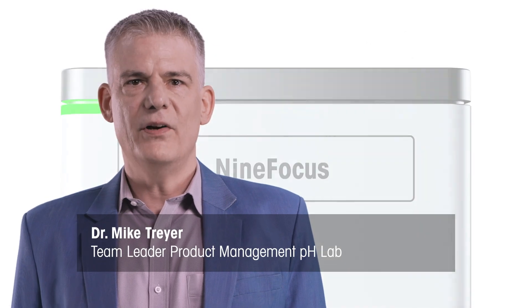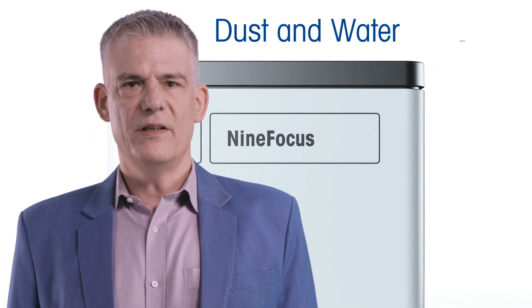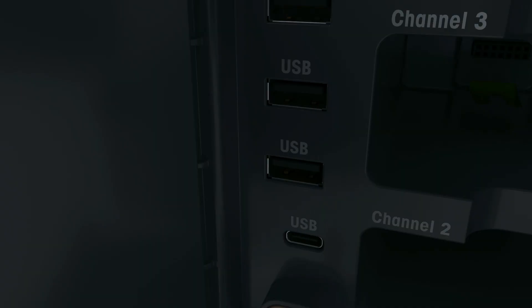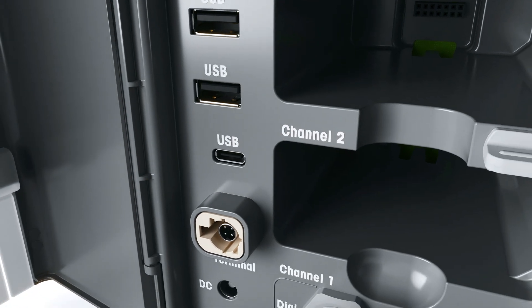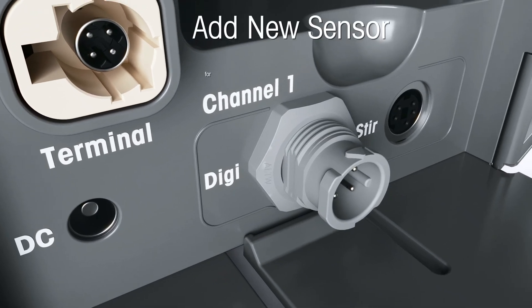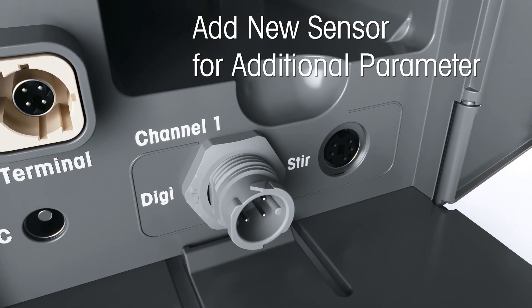Durability and adaptability were at the heart of our design process. The 9Focus meter comes in a dust and water resistant case, perfect for the hustle and bustle of a busy lab. But protection alone wasn't enough. We wanted a system that can evolve with your needs. That's why we made it modular. You can easily swap in parameters and expand its capabilities. With a built-in digital measurement module, you don't need multiple meters for different applications — just add a sensor and turn your pH meter into a conductivity meter, for example.